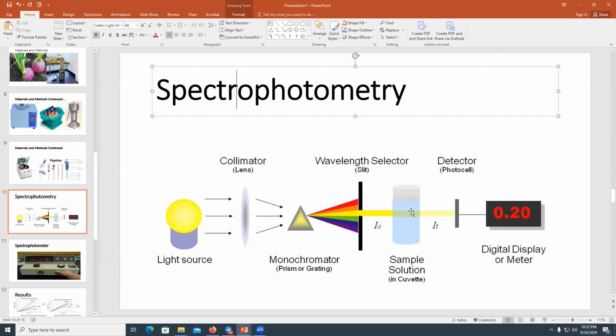And we will see that temperature will have an effect on the density, on the concentration of that Guaiacol color, indicating that, for example, if we heat up the test tube, the cuvette, or boil it so much, then that is going to denature a lot of our peroxidase, because that's an enzyme. And then we will not have as much product turnover like oxygen, and therefore not a lot of Guaiacol is going to turn into amber. So that's what we're appreciating.